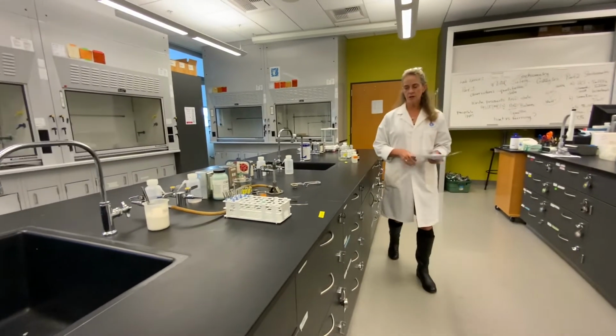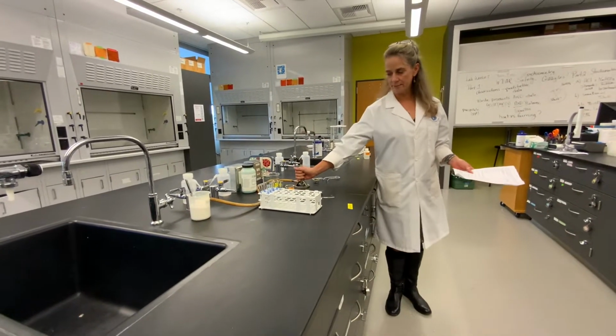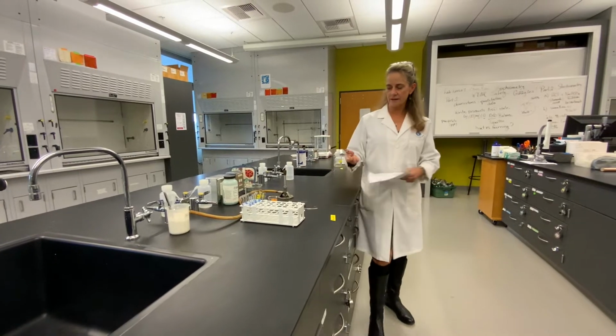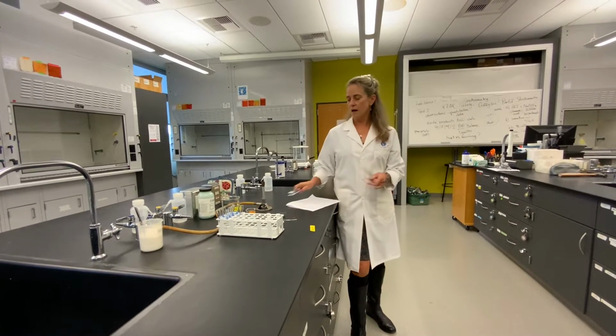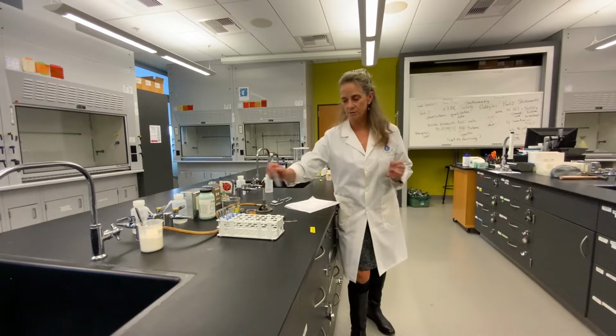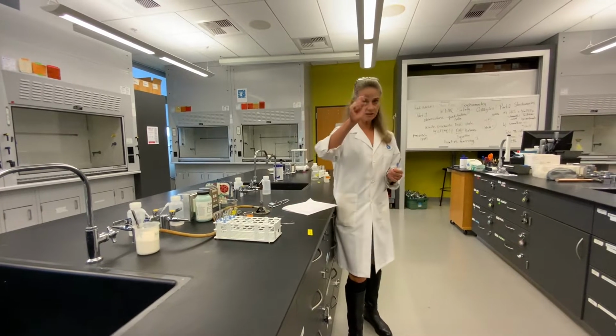Number 1, okay. Number 2, you guys are gonna practice using the Bunsen burner, right? And you guys know how to light that with your striker. So you get to use the striker again. You're going to utilize these test tubes, so not out of your drawer, and a test tube holder.